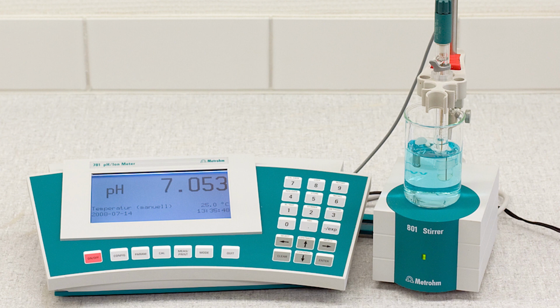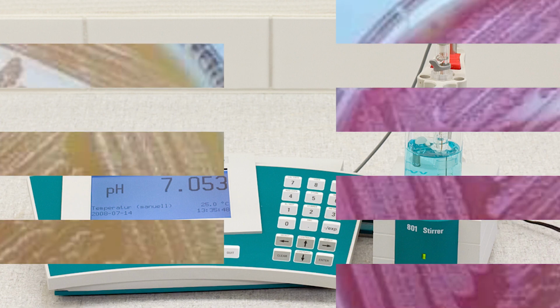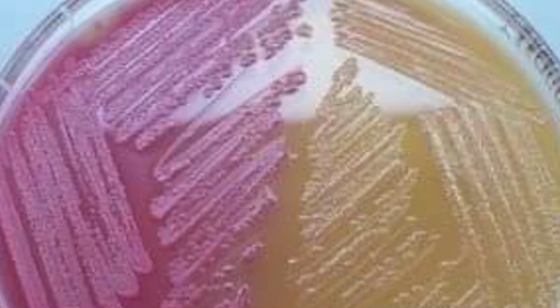The pH is a basic and important concept of MacConkey agar. The pH should be adjusted to 7.1 plus or minus 0.2 when the media is prepared. 7 is the neutral pH and it is prepared at neutral pH. The color of colonies depends on the acid product of the bacteria.